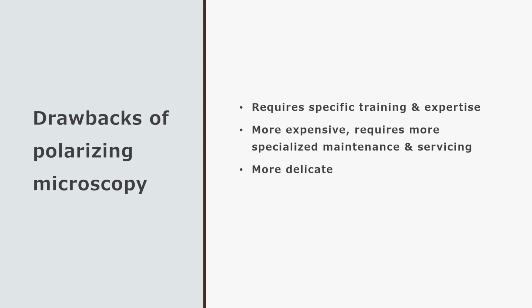Major drawbacks are basically departmental burden type of drawbacks. It's delicate. Of course, there's more stuff going on. You have very precise instrumentation built into it, extra over and beyond a compound microscope. So, you know, it's more breakable. It's a bigger pain when it does break because, whoops, you're going to need more specialized maintenance. That's going to be more expensive. It might be more time consuming to do. It might be harder to get people out to do it.